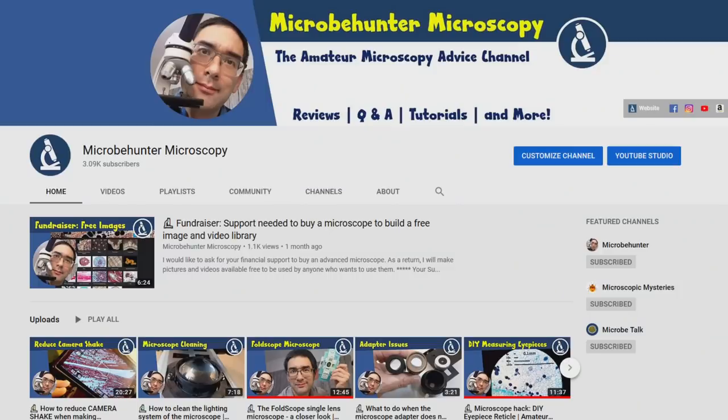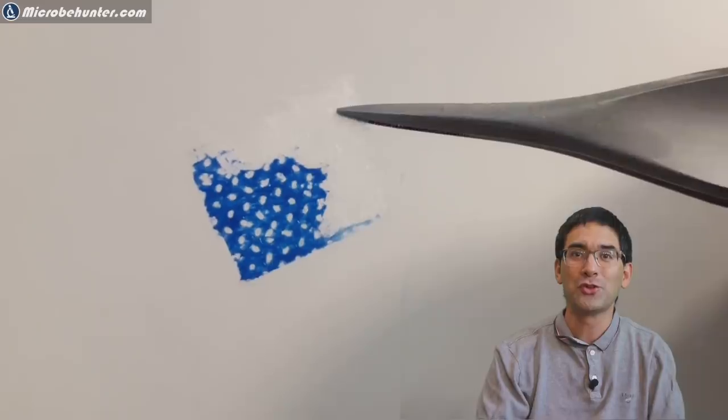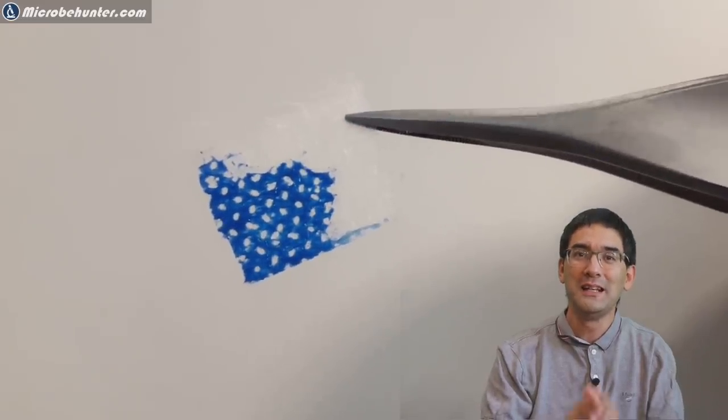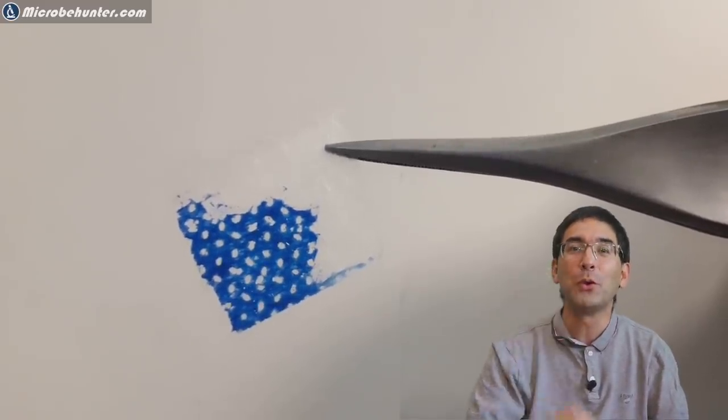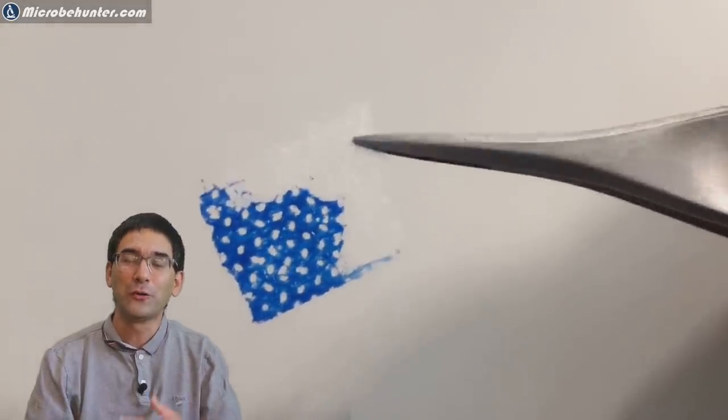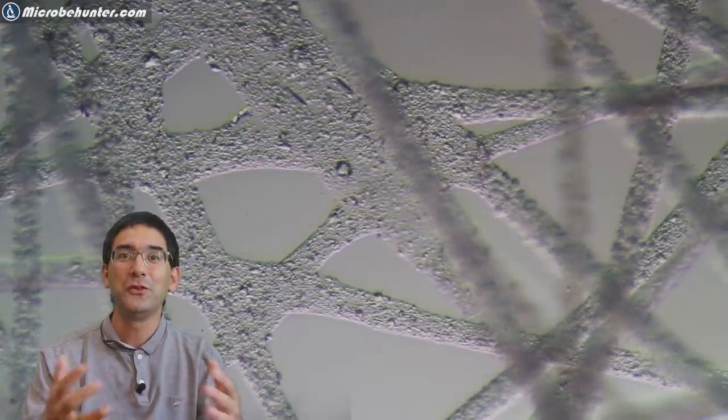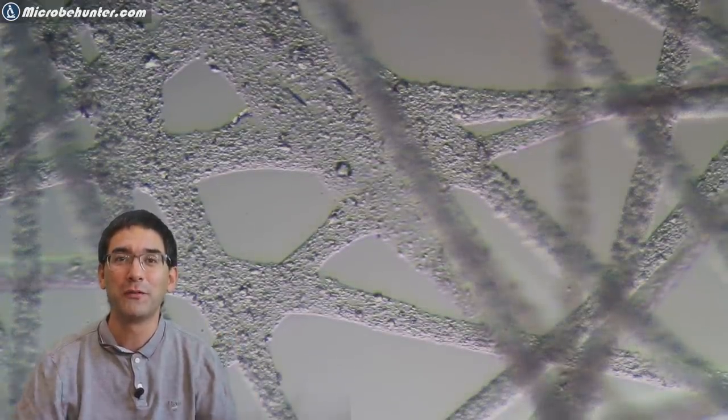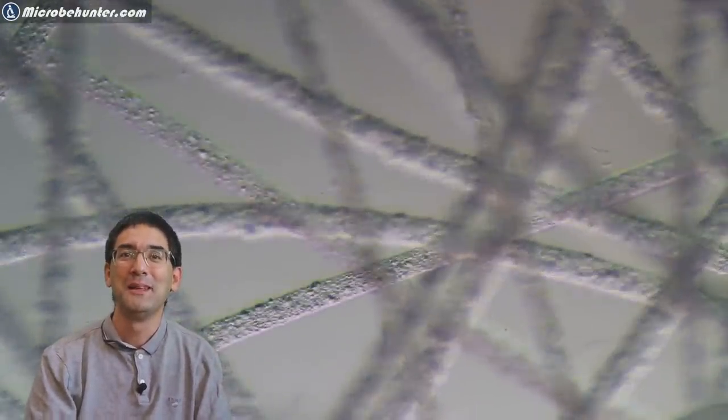What you see here is the face mask that I did manage to stain with a little bit of ink. You can see quite nicely that those patches where the fibers are fused together are now white spots in a very regular pattern. This is also in dark field and also in oblique illumination, which gives us some very interesting views of this face mask. Who would have thought that a face mask like this is actually quite interesting to look at?